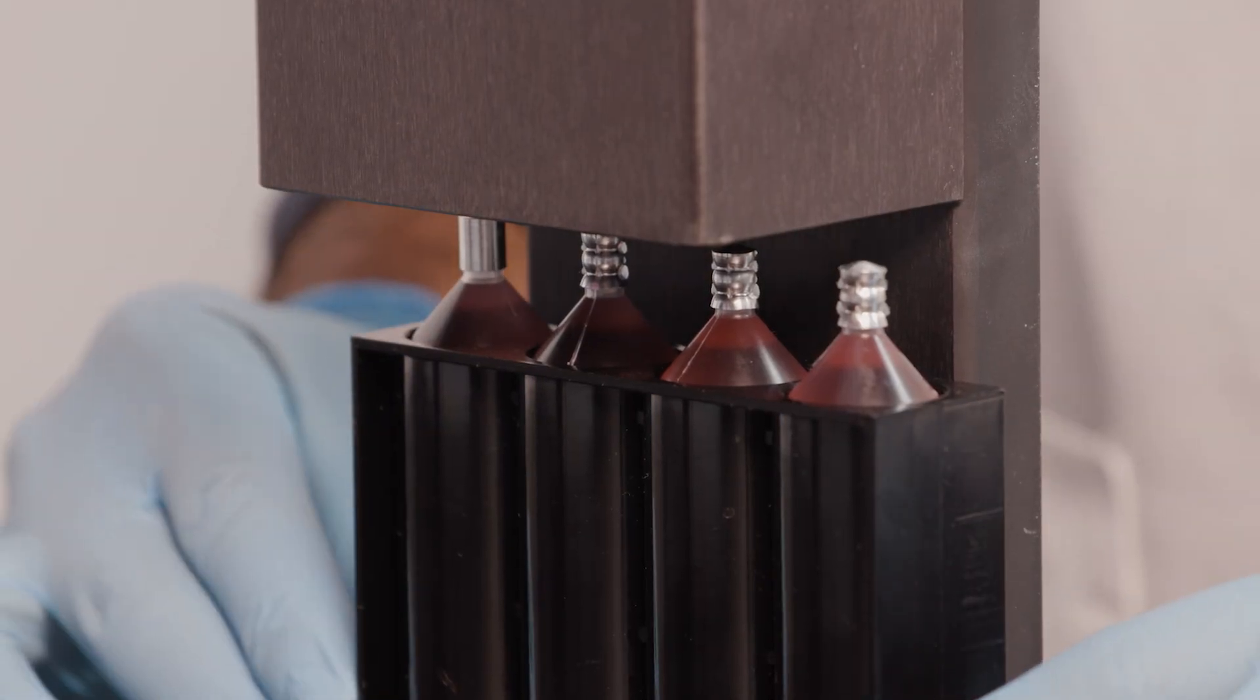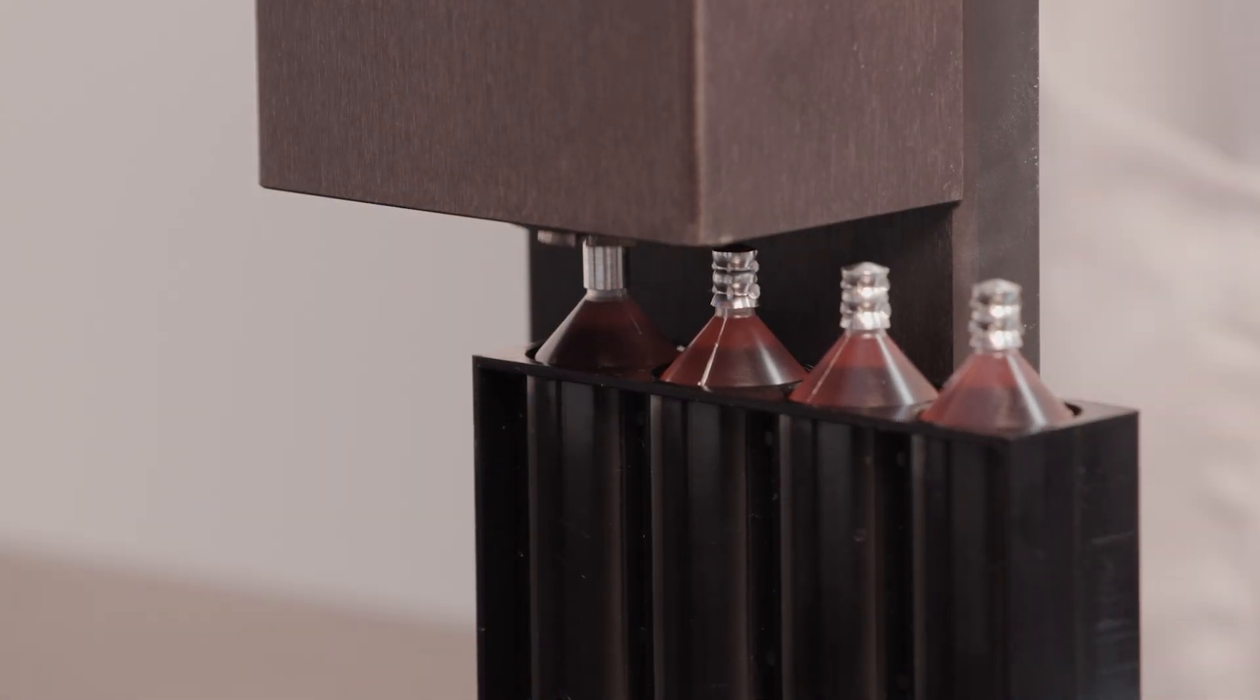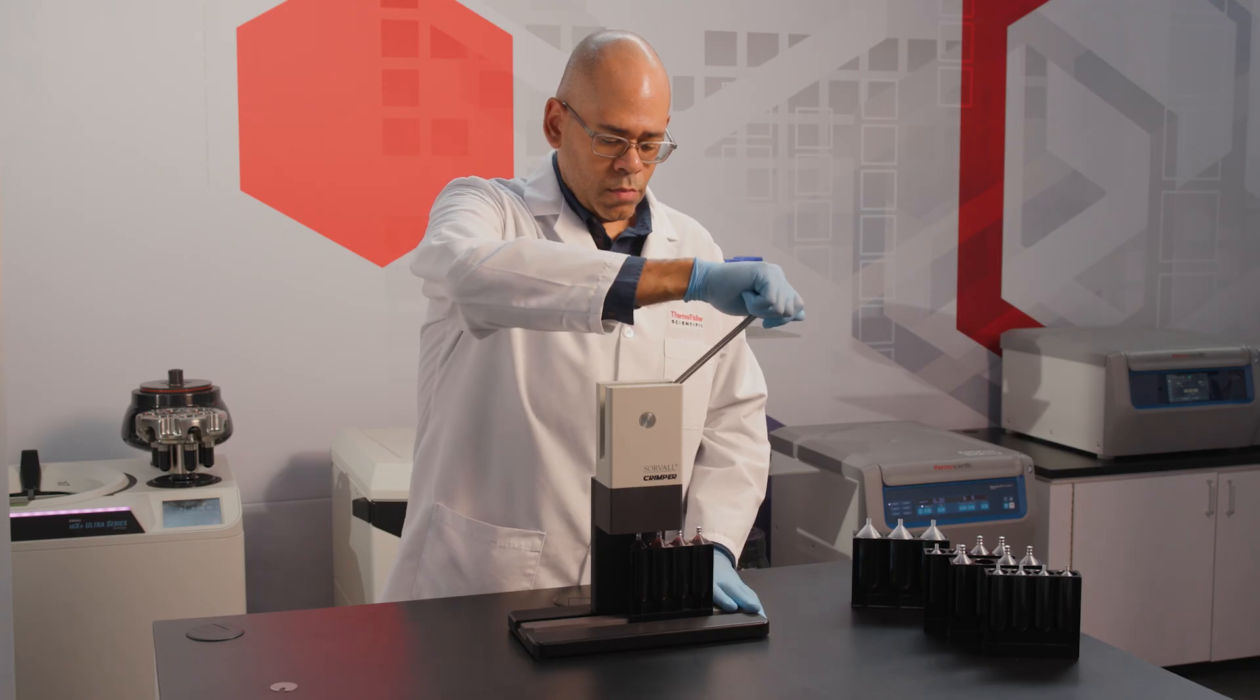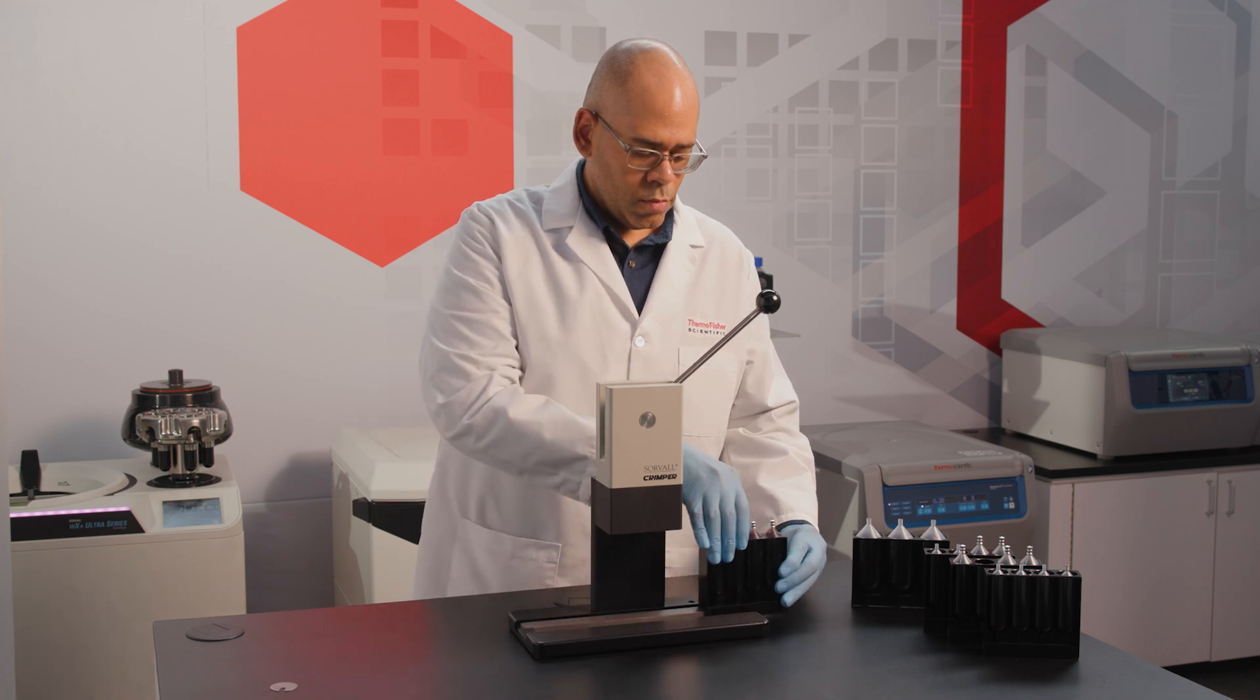Finally, slide the rack to move the next tube into position under the crimping collet. Again, the rack will click into place. Repeat the crimping action and continue until all the tubes have been sealed.